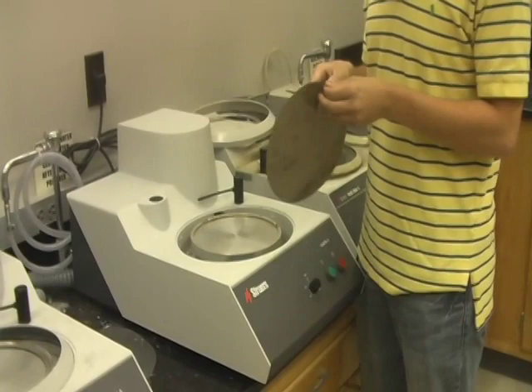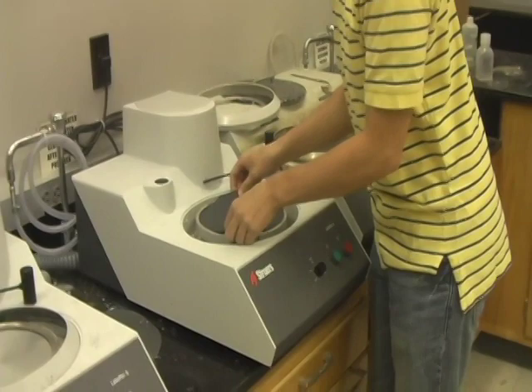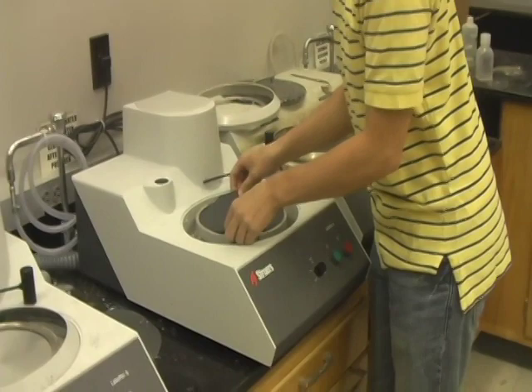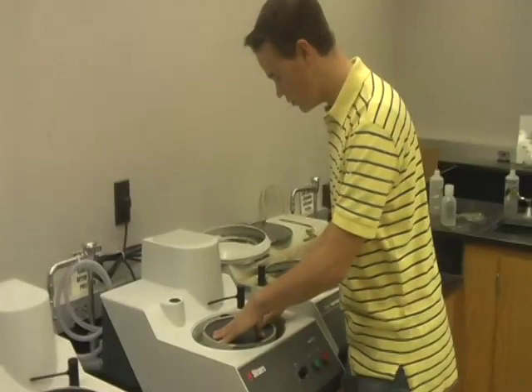When you've selected the right grinding pad, take the adhesive backing off of the back of the pad, and place it firmly onto the turntable, trying to center it in the middle. When doing this, run your fingers along the outside of the pad, smoothing out any wrinkles or air bubbles that may exist. This could cause unnecessary scratching later on when you're grinding your specimen.